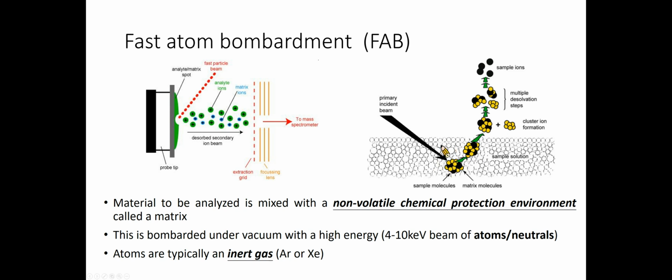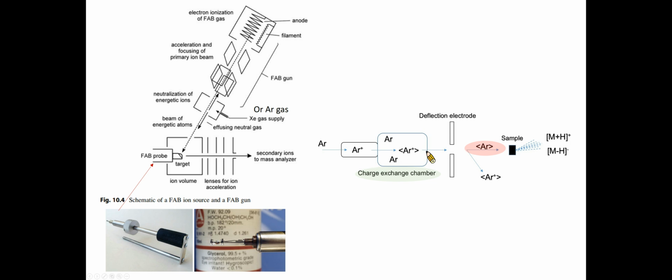In addition, ions from the matrix itself should be as unobtrusive as possible in the resulting FAB spectrum. The matrix itself has to be chemically inert. However, specific ion formation reactions promoting the secondary ions yield more advantages. The FAB gas is introduced via a needle valve into a lower part of the FAB gun, mounted above the ion source.